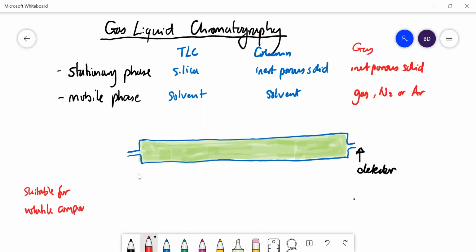Okay, so I'm going to use methanol as an example today. Say you're trying to separate a mixture of methanol and ethanol, and find out how much of each of those alcohols you have in the mixture.